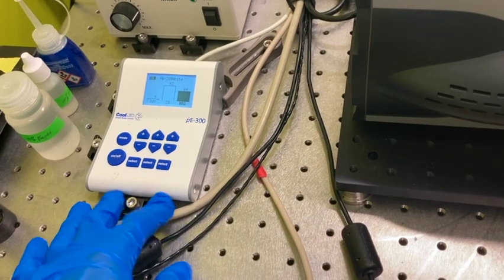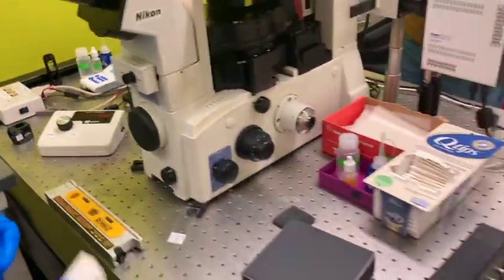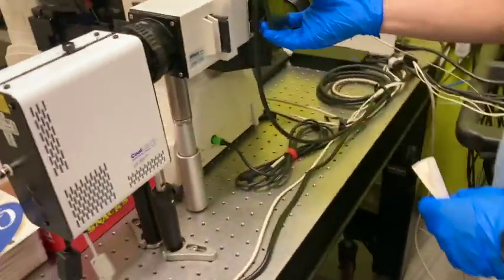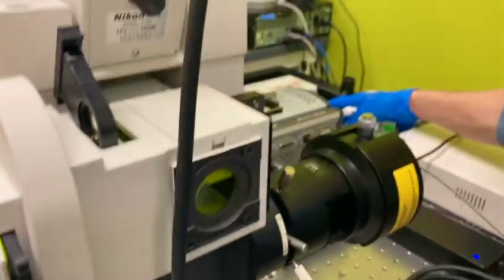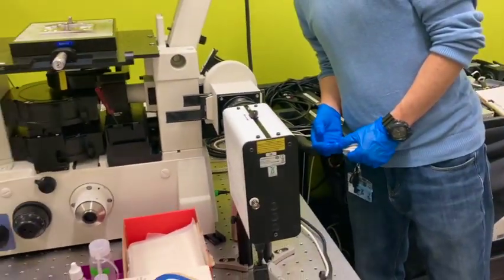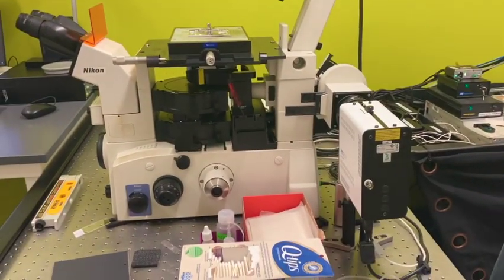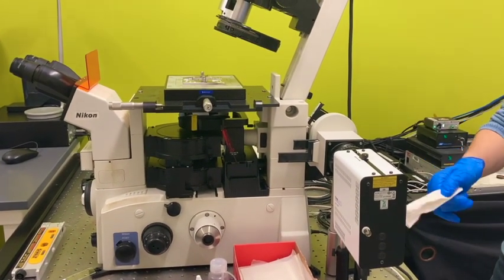This means, yeah, it's green, so green is on, and maybe we can see some green light here. Actually, you can see it inside this. Yeah, it's green, and then if we have this one on, say blue, it becomes blue. So for now we have 3 different lasers and 3 different wavelengths from this LED.